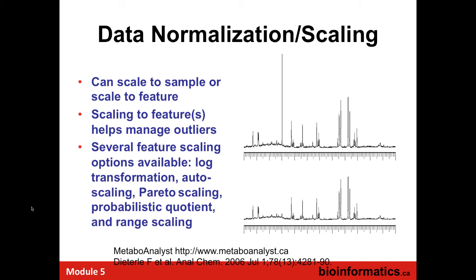So you can see where I'm, again, mixing terms. Well, I'll say scaling, normalization, transformation. I'll say, well, this is converting something so it's a normal distribution. In other cases, I'm saying normalization, scaling, transformation, to say, let's adjust for dilution. And that's a problem of semantics and terminology that's unfortunate, but hopefully, when we say normalization, scaling, transformation, and centering, we put all of these things together to say, okay, we're just trying to make our data a little cleaner, a little more normal, and also adjusting for quality control.